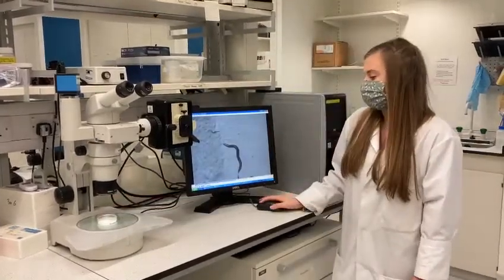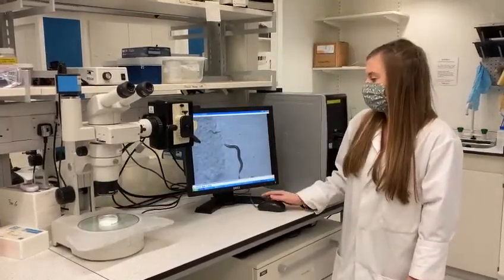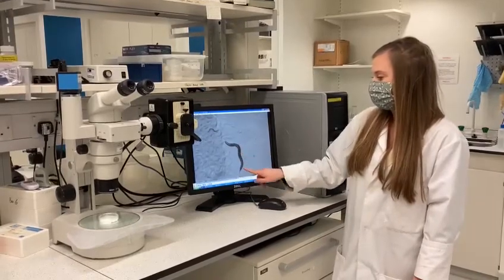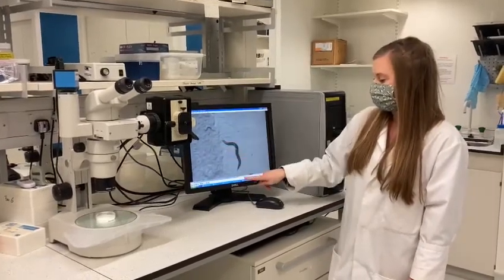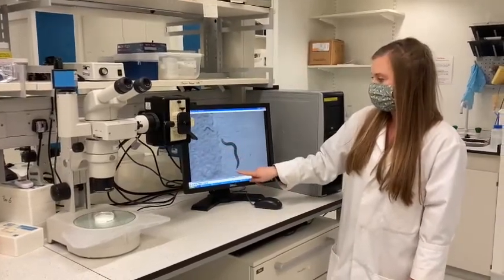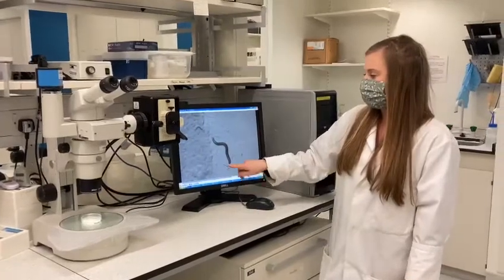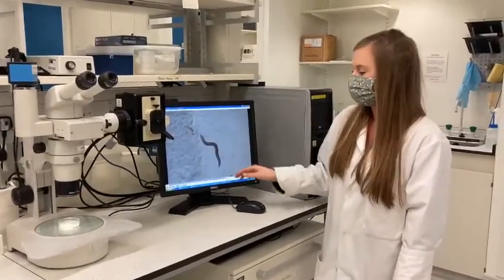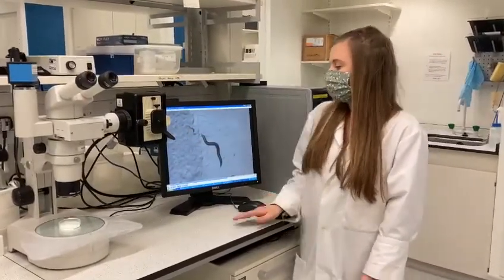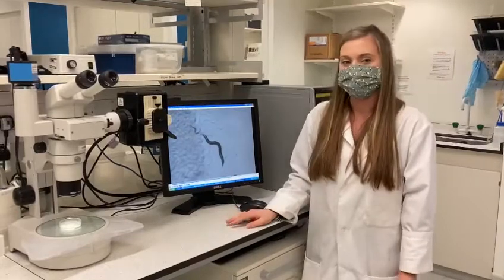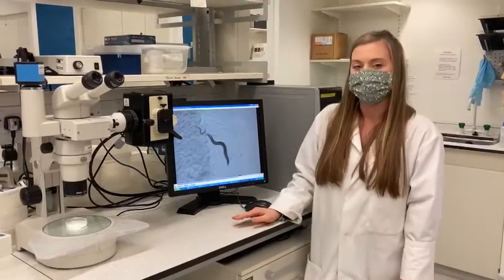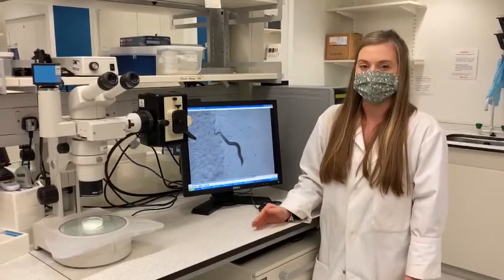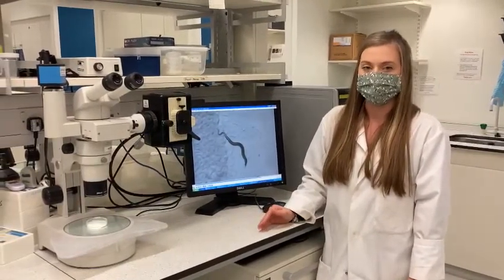When we look under the microscope we can see here an adult C. elegans. This is its head and this is its tail. You can also see some younger C. elegans as well. One of the things we do here is look at the behaviour of the worm and try to understand autism in this way.